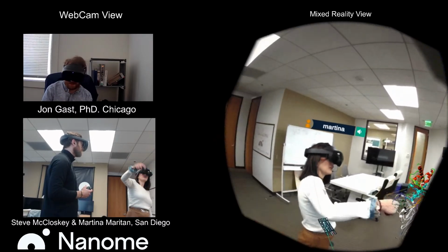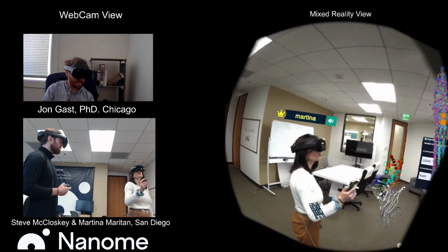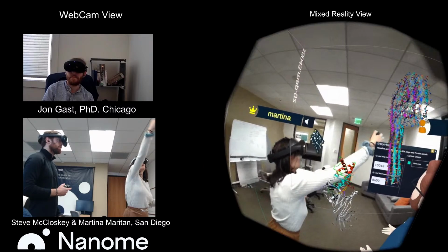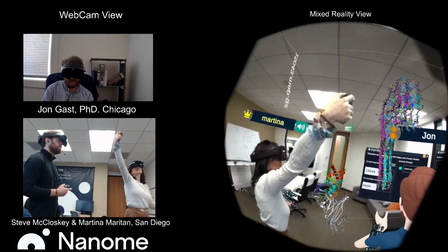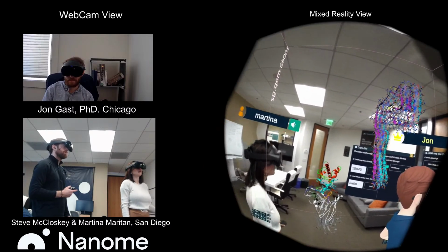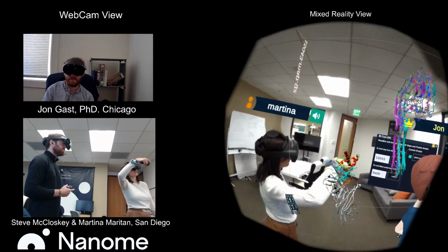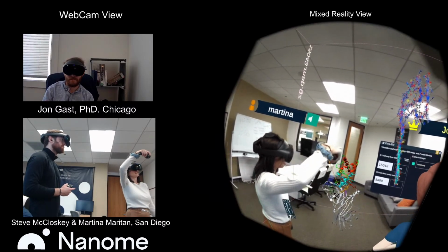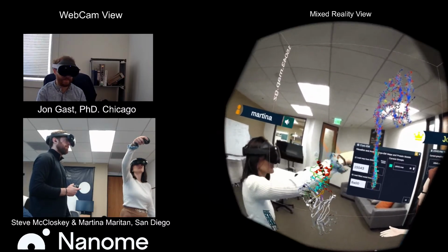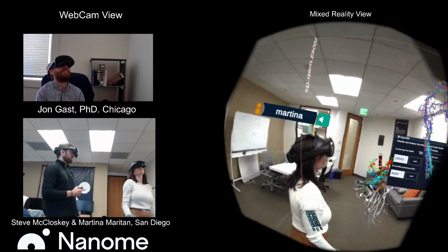The whole concept about using antibodies is to prevent this protein from misfolding and refolding into this perfectly stacked beta sheet. So it's actually very interesting to see how the epitope is localized in the fibril.